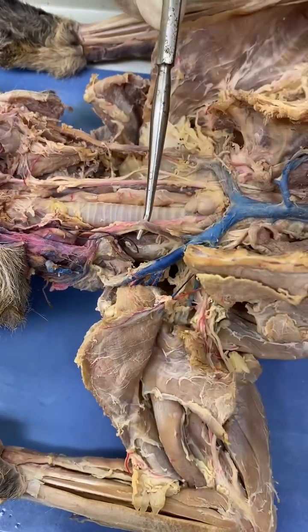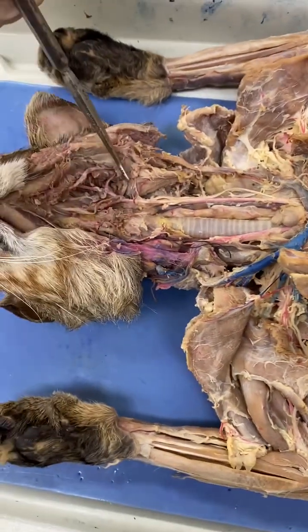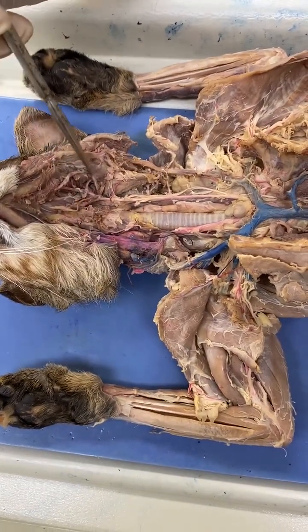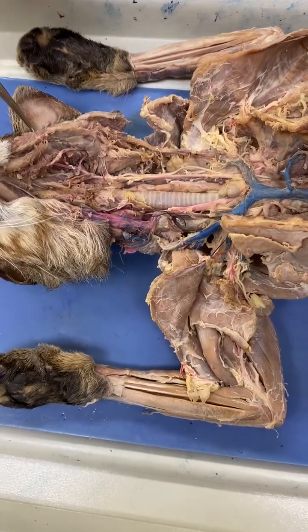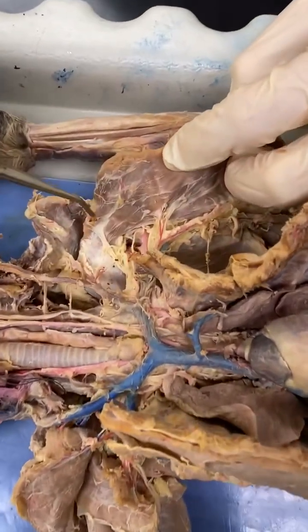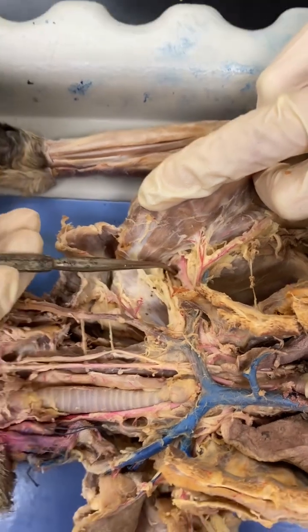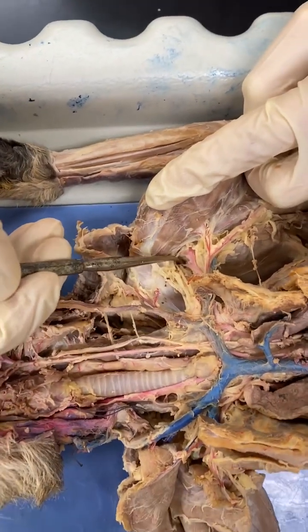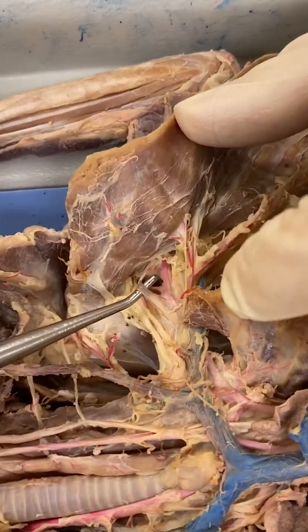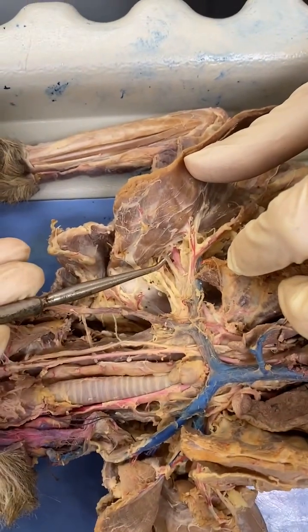It's following the carotid. Transverse jugular would be around this area, and it would go across. Subscapular artery and vein. The subscapular artery and vein are going to branch off of the subclavian. Up here, we have the start of the subscapular artery. And this is the subscapular vein, although it is poorly dyed. You can see where it traces back to the subclavian.